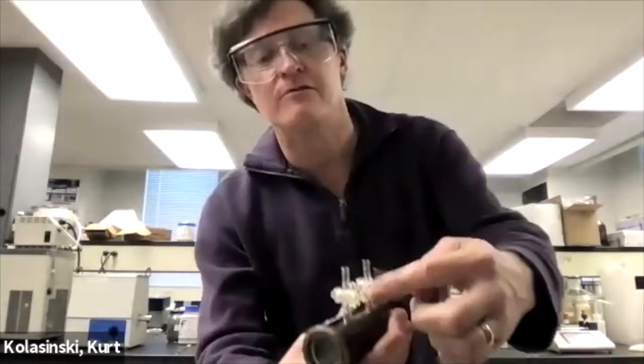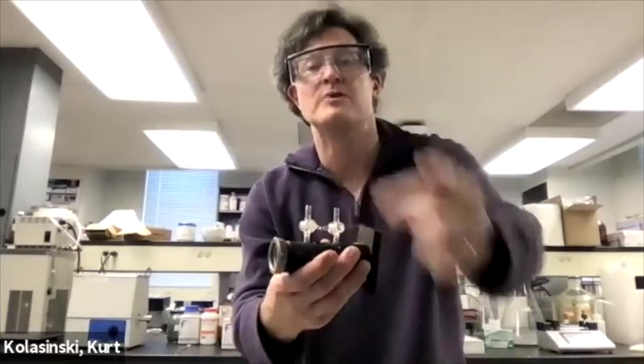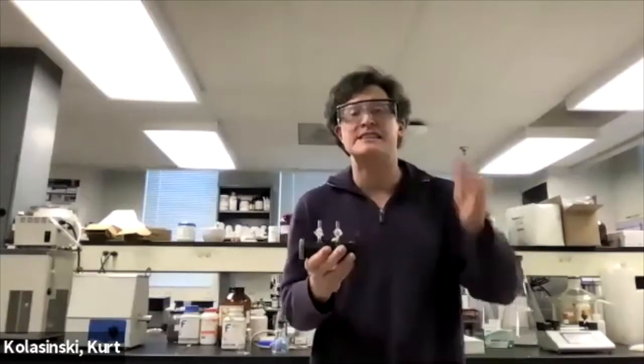But we have to hold the gas in there, so how do we hold it? We got a couple of valves up here, right? They're closed when they're crosswise and open when they're in line with the glass tube. We also have some windows. The windows are very important. They have to let infrared through. So there's sodium chloride. That's right, there's salt.